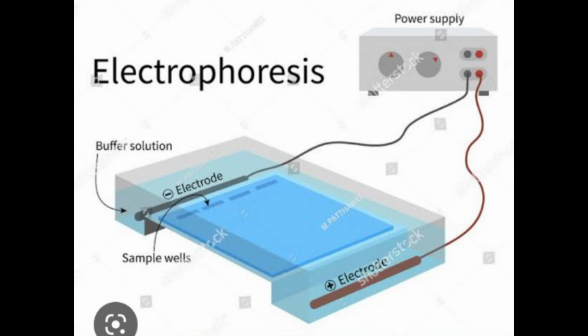Each possesses an ionizing group and hence exists as a charged molecule in solution, either as a cation or anion, depending upon the pH of the medium used. Non-polar substances such as carbohydrates can be given charge by derivatization, for example, as a borate or phosphate. These charged particles, like cations, move towards the cathode, and anions towards the anode in an electric field.